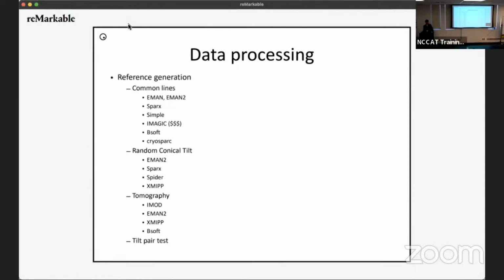That's one of the major parameters in your classification, so that's the right question to ask. In my experience, you get good-looking classes with 500 particles per class. You can still get pretty good classes with 200 particles per class if you have good signal in your data.